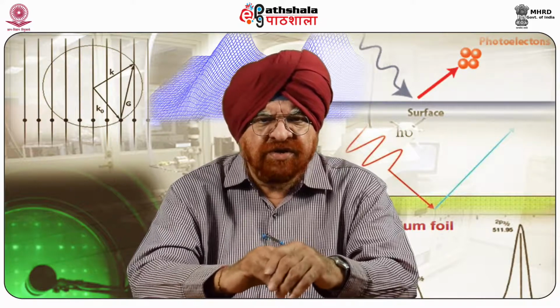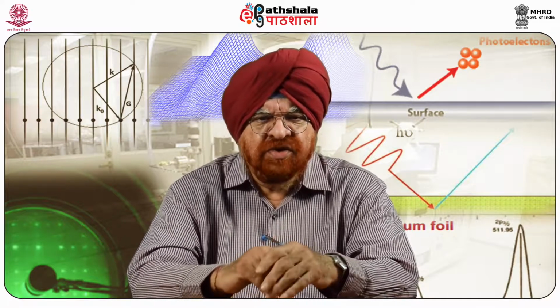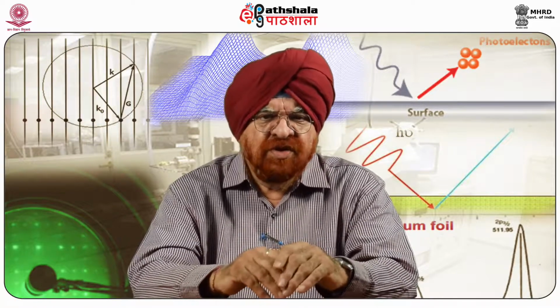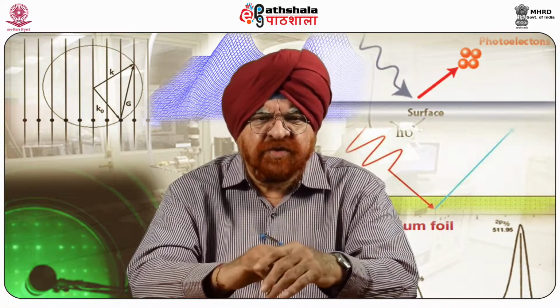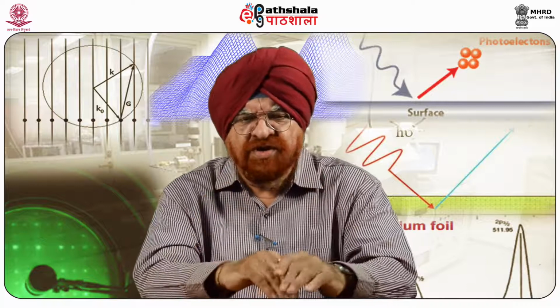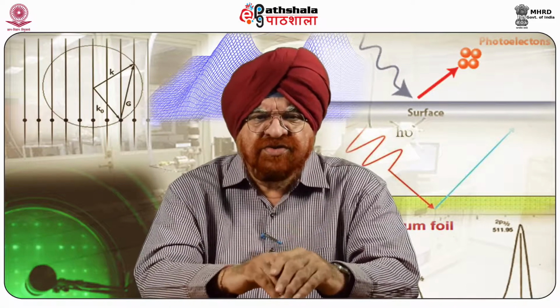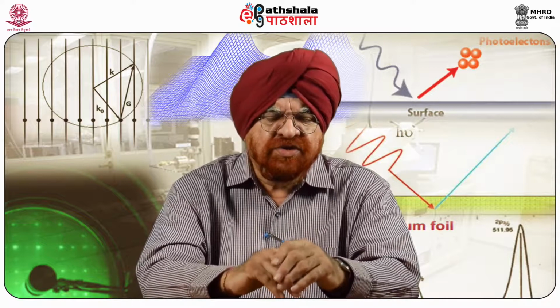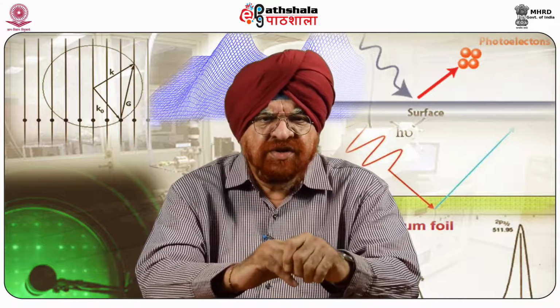Long-range magnetic interactions are not sensitive to surface contamination. Therefore, one can study that also. No special surface preparation or coating is required, as we have in the case of a large number of electrochemical techniques, where the surface preparation plays a very important role. Deposition of thin non-magnetic layers on the sample does not alter the results.